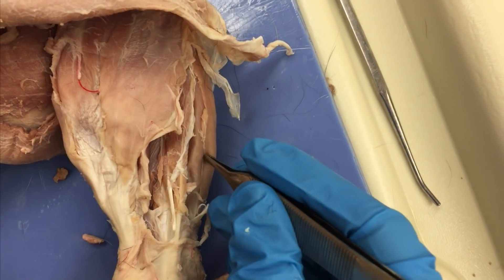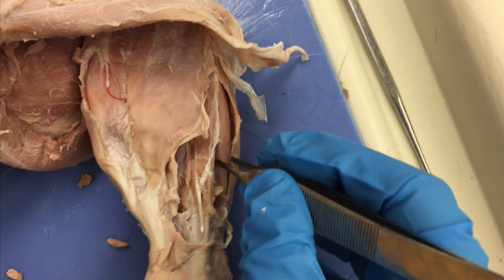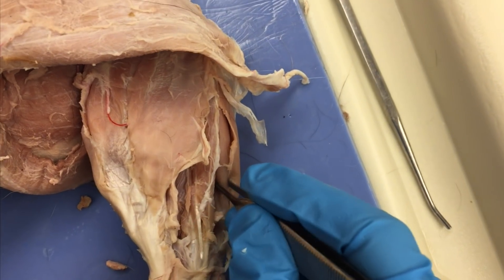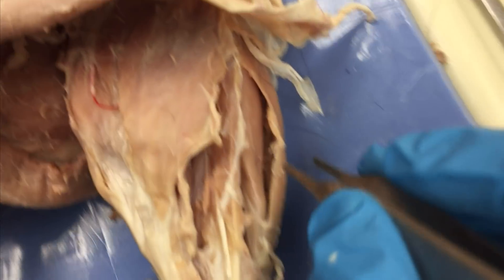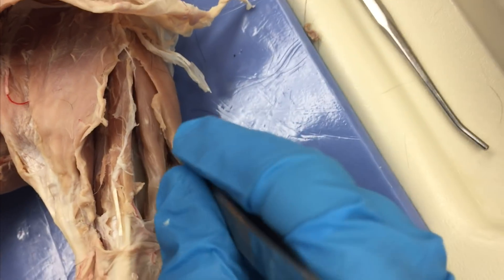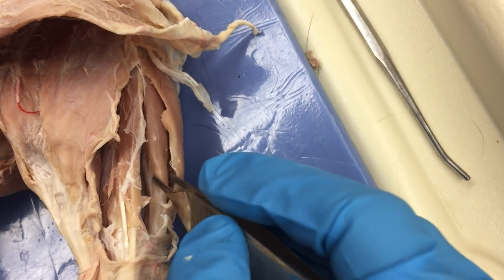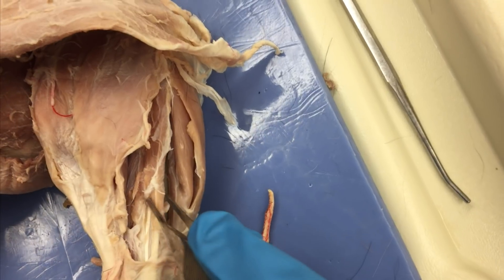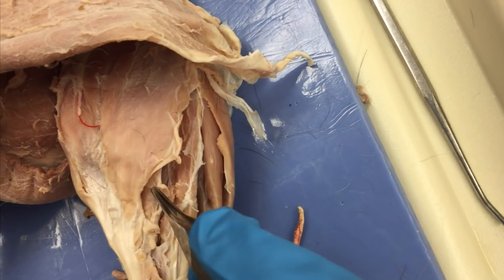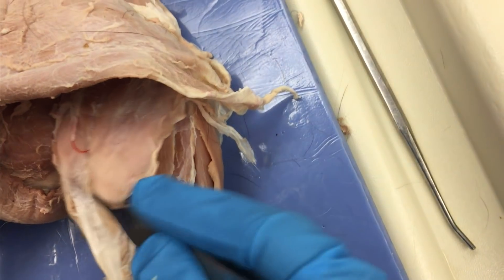Then right here, as we move more anteriorly, you have two more muscles. This is my extensor digitorum longus, and then this one that wraps around the front is my tibialis anterior. So: tibialis anterior, extensor digitorum longus, fibularis longus, and the group of fibularis muscles. Separate this out to see the soleus and the gastroc.